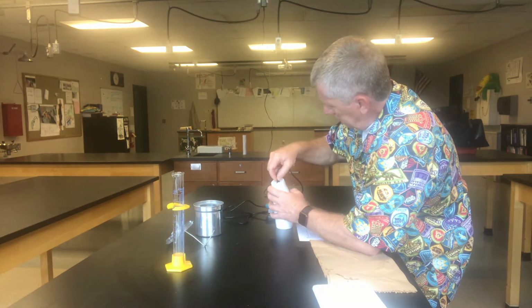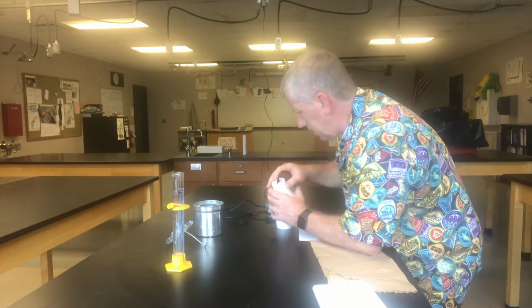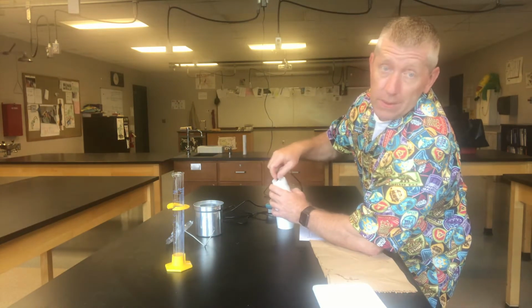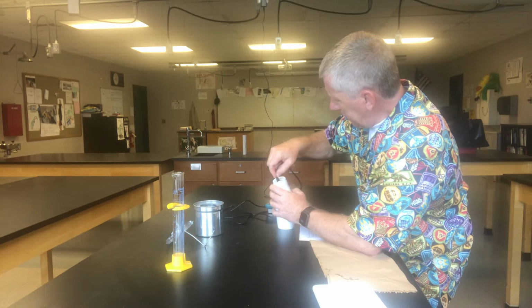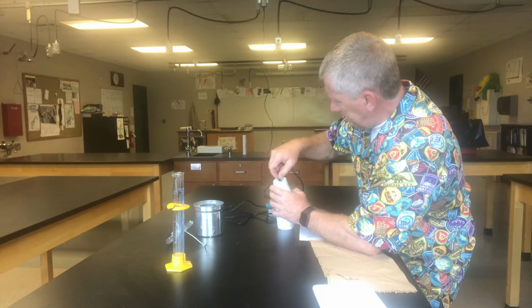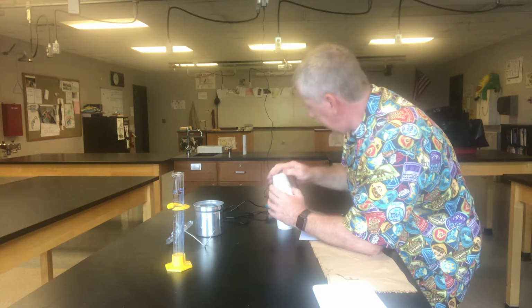20.0. Okay, still mixing it with the ice gone. Not quite. It's just a smidgen left. Smidgen. That's small, by the way. Okay, it's slowing down. It's 18.8, 18.7. It seems to have stuck at 18.7. I think we've got the equilibrium temperature, but let's check and make sure we've melted the ice. We have melted the ice.